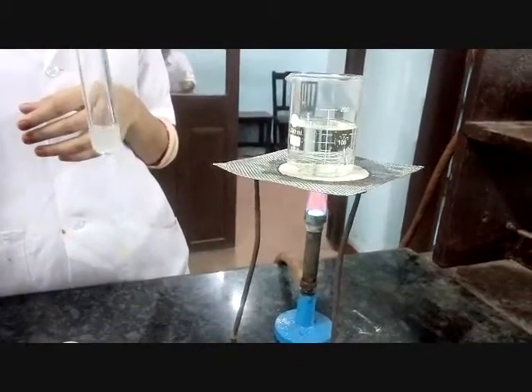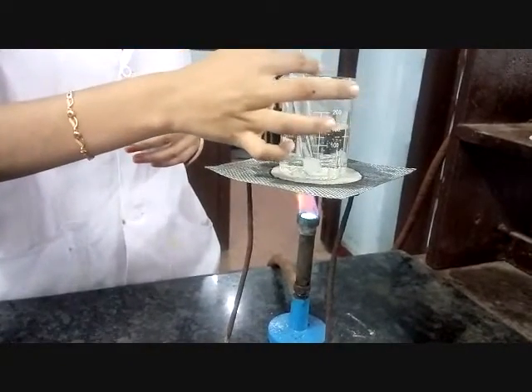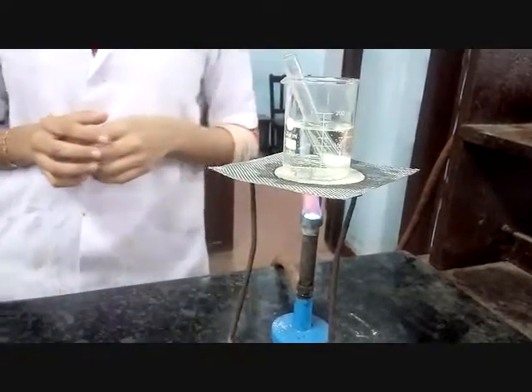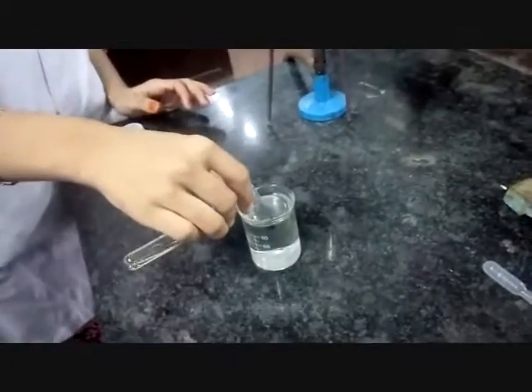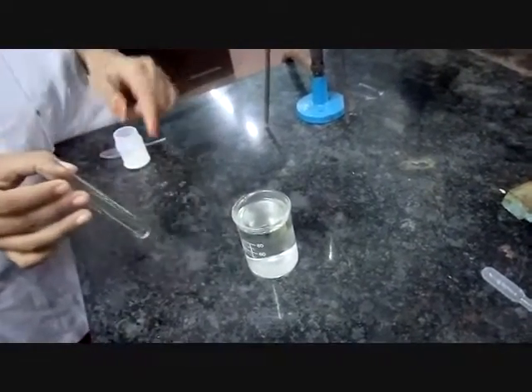Heat the mixture on a boiling water bath for 15 minutes and then pour it into cold water taken in a 100 ml beaker. No yellow color. The compound is aliphatic.